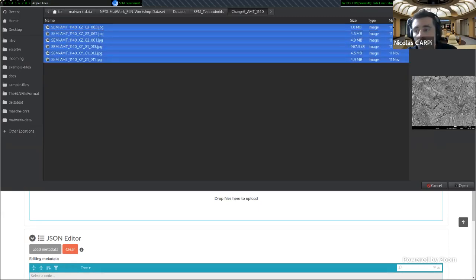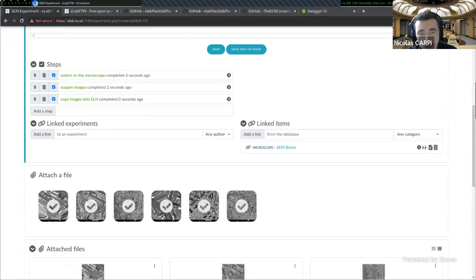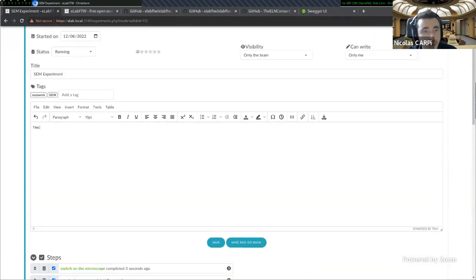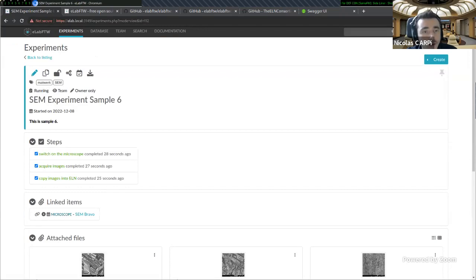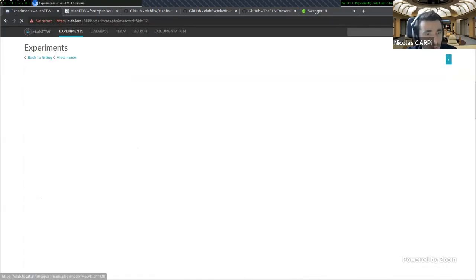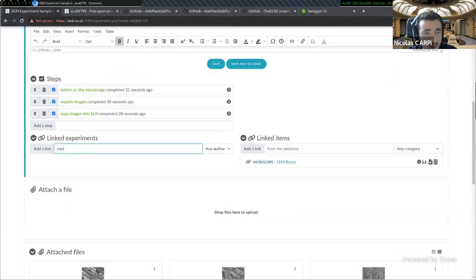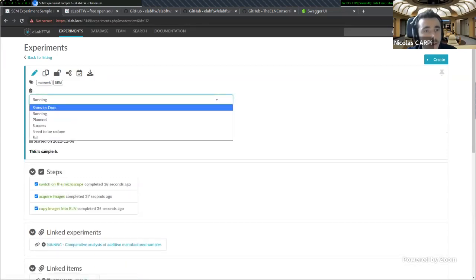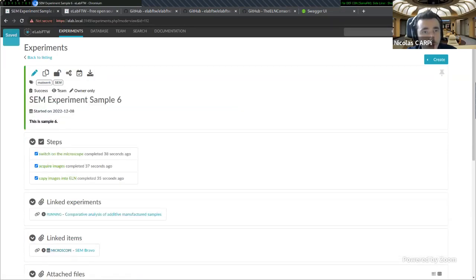So probably you will do one experiment for sample 6 and one experiment for sample 1. So this is sample 6. Let's make it like this. Sample 6. Okay. And I forgot to link it to my master experiment. Okay, so as you can see now we have our experiment.